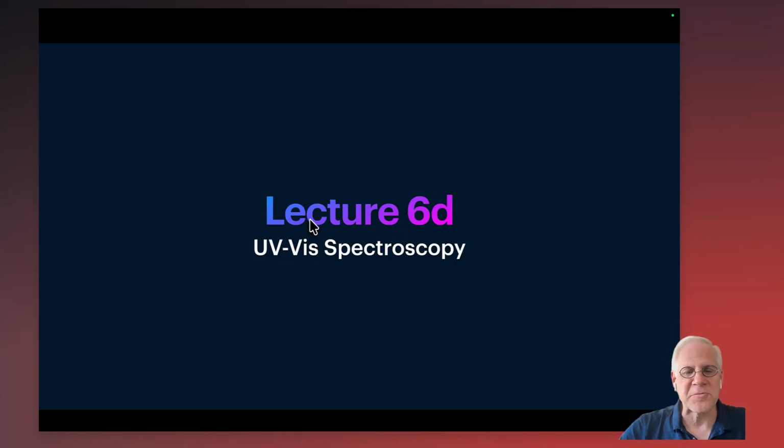All right, well, here we are at our last part of Lecture 6, and here we're going to look at UV-Vis spectroscopy, so ultraviolet visible spectroscopy, very commonly done with the same machine. We have several UV-Vis machines at our program, and they go generally from about 360 nanometers or so, maybe even to 200 nanometers, well into the UV, and they may even go up to like 1,000 or 1,200 or 1,400 nanometers of wavelength into the near IR. So they span quite some distance.